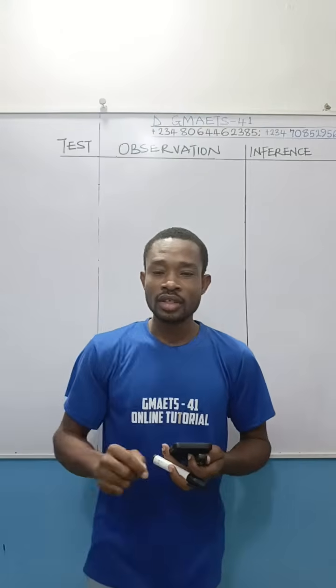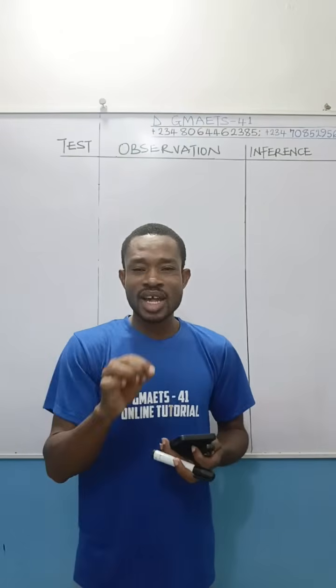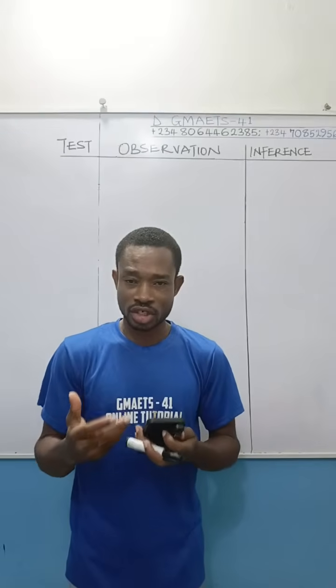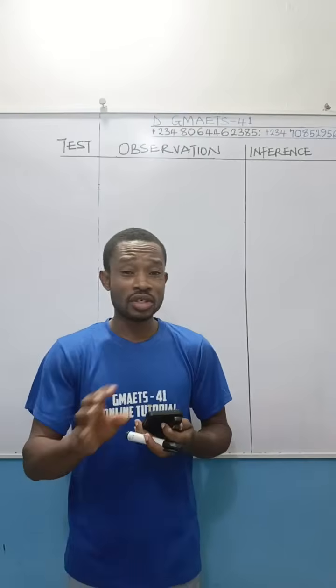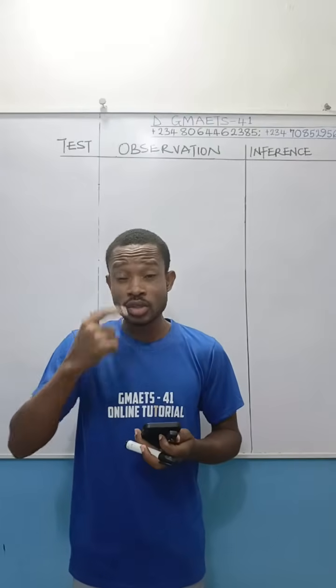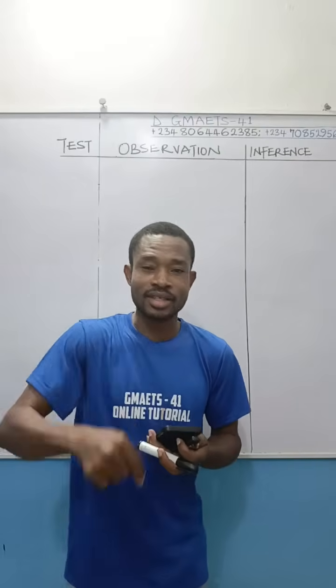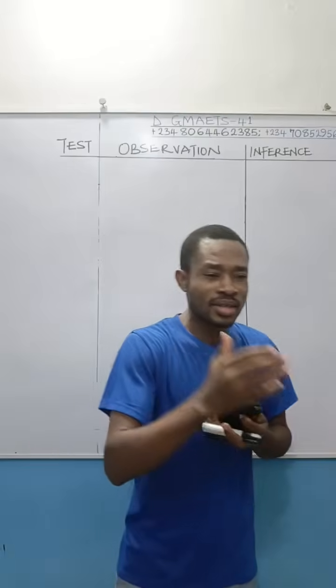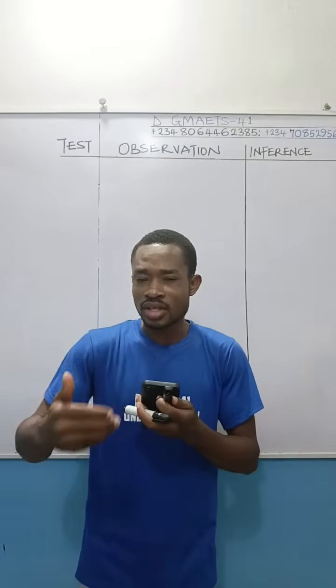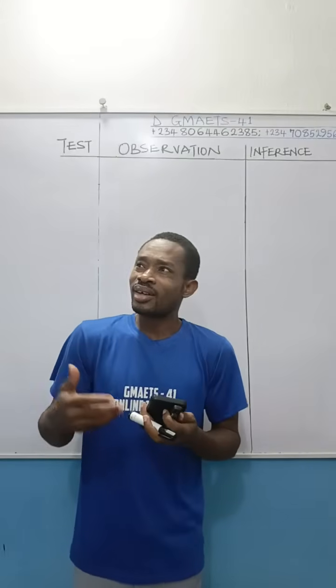Secondly, the ions that these reagents are used for, what is the observation? When you talk about the observation, here we give attention to color changes. Are you getting me right? Color changes. You are expected to know these color changes theoretically, so that by the time you enter exam hall tomorrow and beyond, when you are carrying out these experiments and you are seeing this color change, you will not be thinking, what is this?